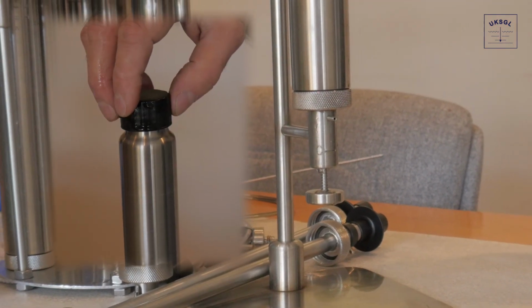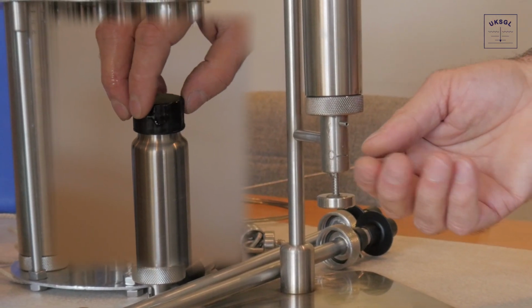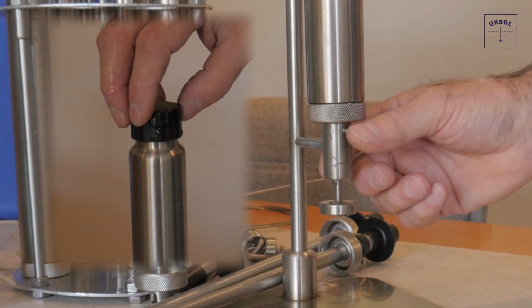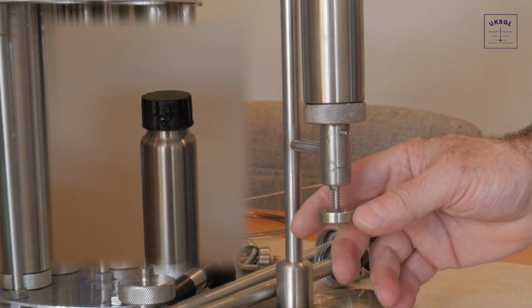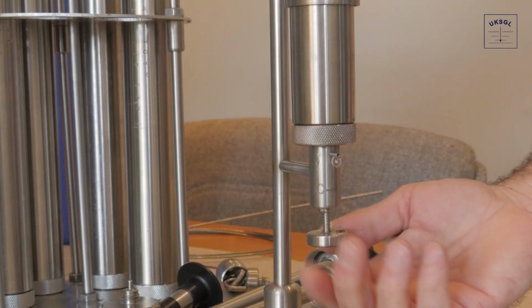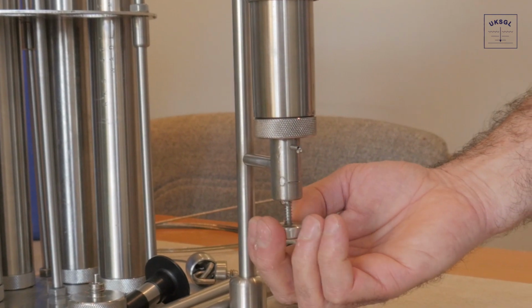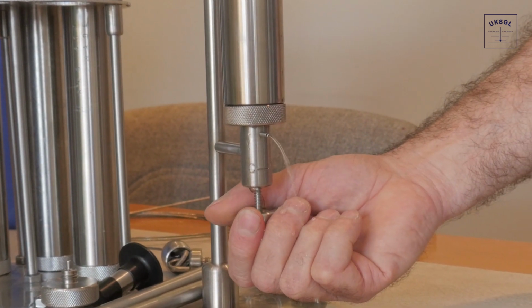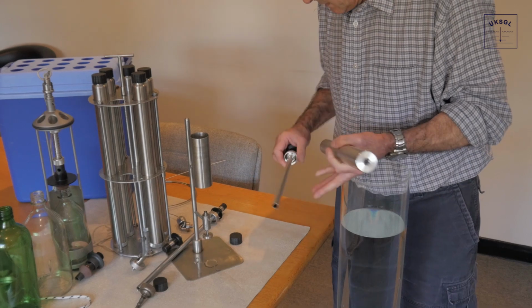The top black cap is slowly unscrewed, thereby releasing the vacuum. The screw tap beneath the spigot is turned to release the liquid into the pipe to the analyzer. To take a spot sample, a spot sampling probe is attached.